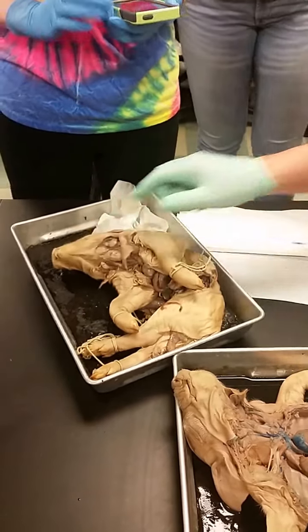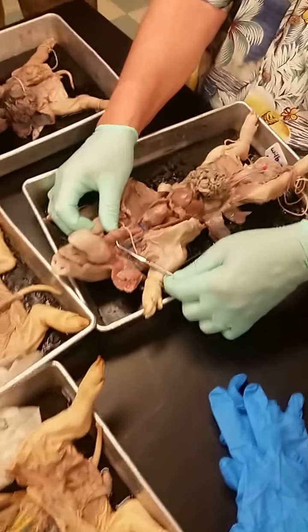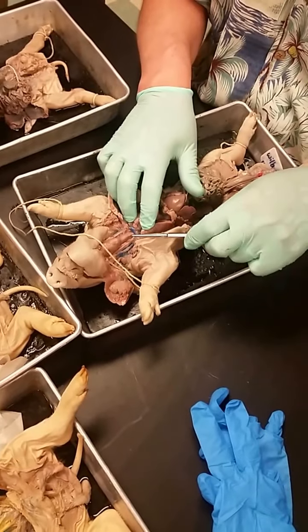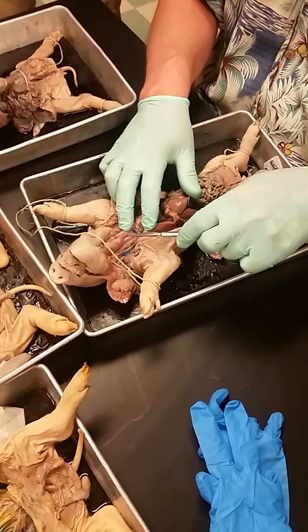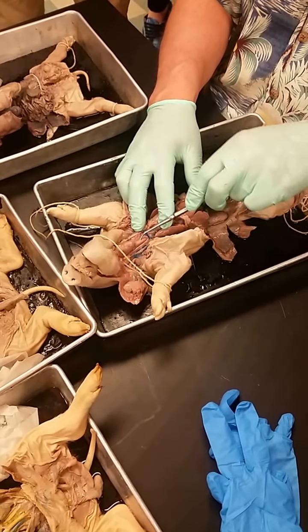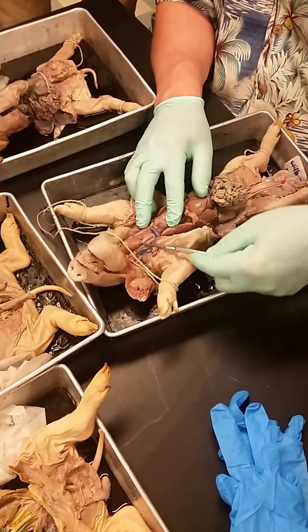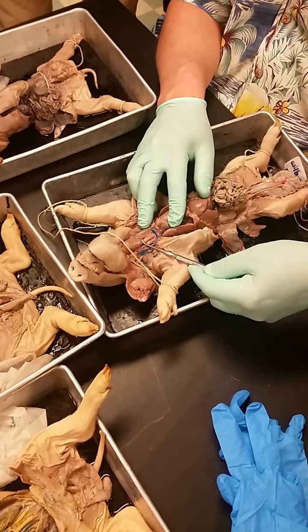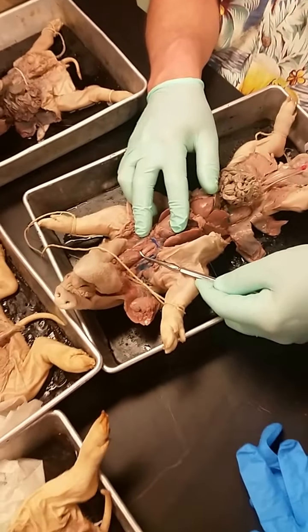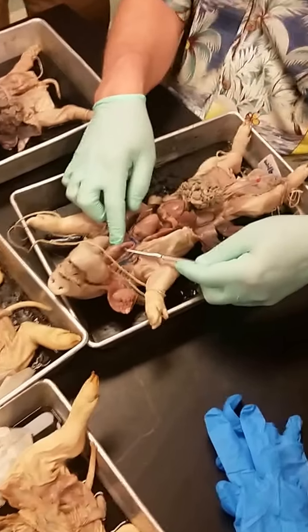Okay. Now, on this one, here's the larynx, and you will notice right here, see all the C-shaped rings? So that would be the trachea. And then if you go underneath, that structure would be the esophagus. So there's the esophagus right there, but it always lies posterior to the trachea.